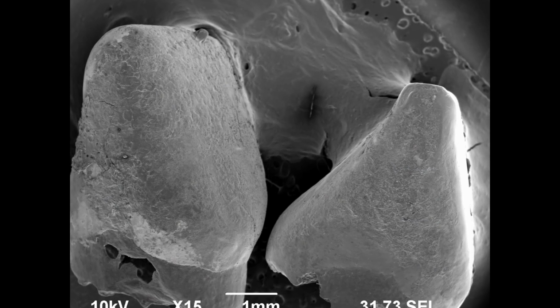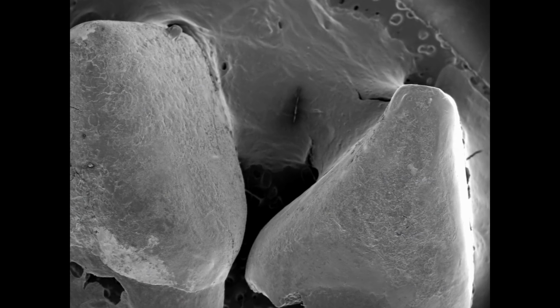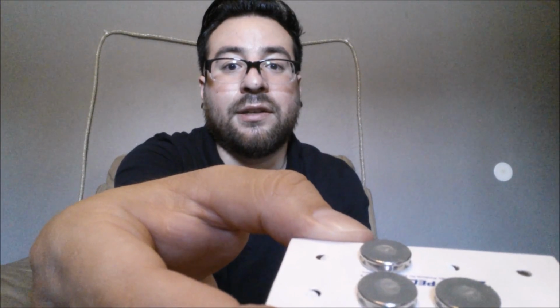Let me show you another sample. Every semester, we've got to take a safety test, because you need to be careful with the chemicals and stuff like that, and you don't want to kill anybody or yourself. But these are the stubs. That's how the stubs look, like the one I just showed you with the teeth.